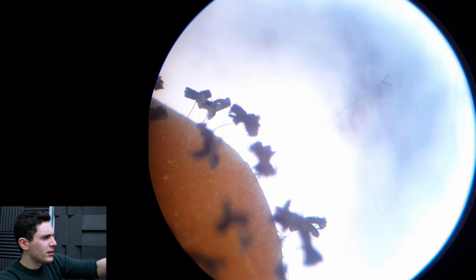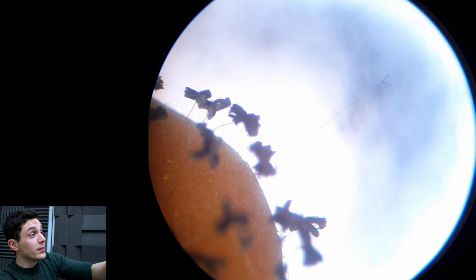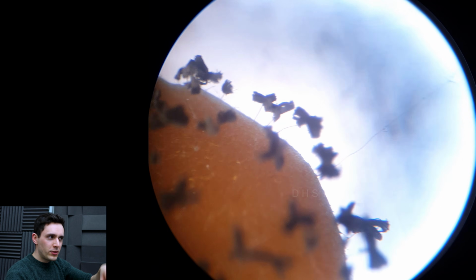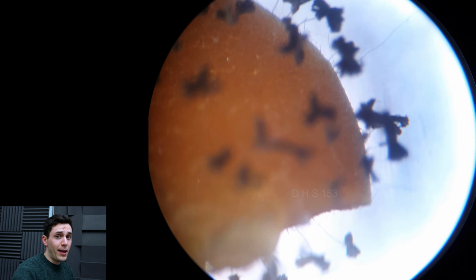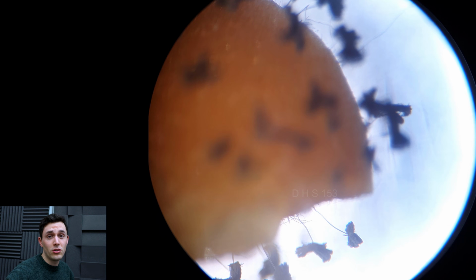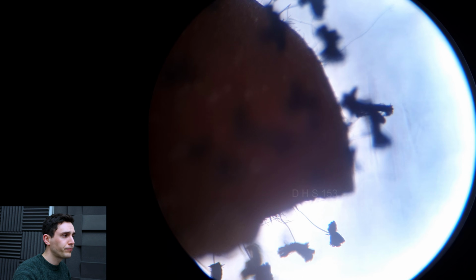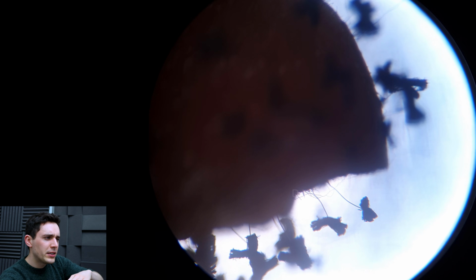And just here, actually, you can see that random offshoot. This is a very clear sign that the fungus, you'll see it later on in the video, is not just growing on the apple or the earwax anymore. It's totally spread out across this test tube, and it's growing up on the side of the plastic and everything, and even the little smearings against the plastic where I shoved in the apple, it's growing on that and it's creating spores, and it's just everywhere.